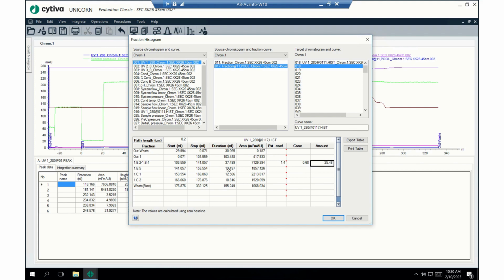So that's how you calculate the protein concentration. In the other example, I pulled samples off. I didn't do it for this run, I did this run years ago. I pulled samples off and I've actually measured the protein concentration. It's dead on, as long as the absorption range is still in the linear range. And I find it's linear up to about 2 absorption units, so that'd be like 2,000 milliabsorption units. So let me show you how to calculate this number really fast.